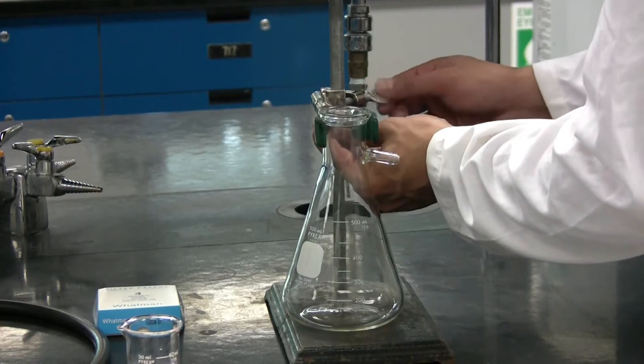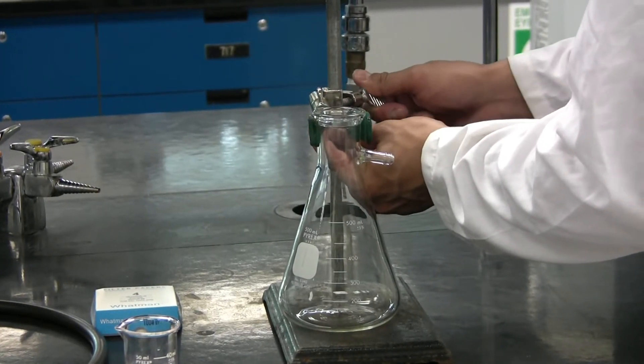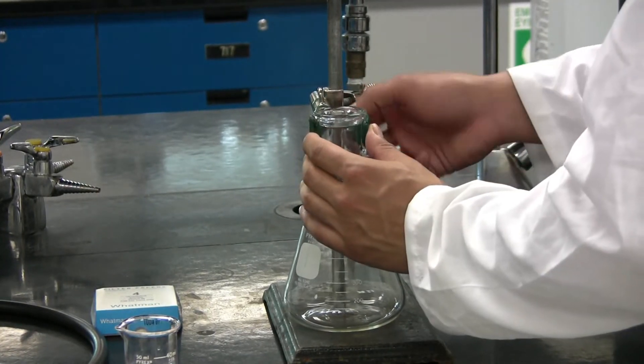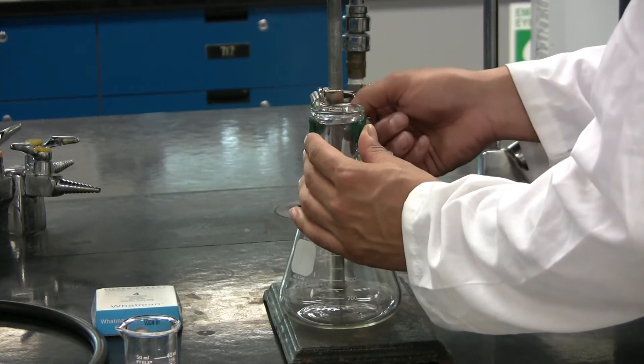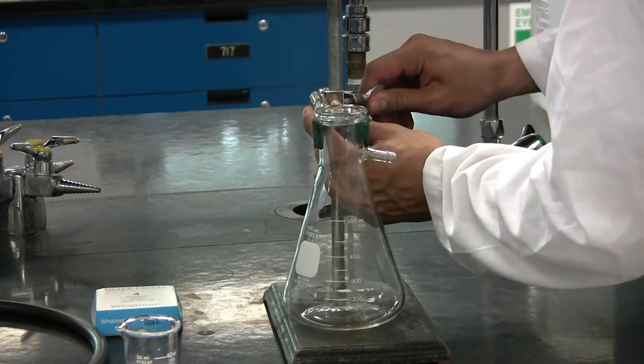Start by securing the vacuum Erlenmeyer flask to the retort stand using the clamp. Make sure all parts of the clamp are securely fastened.